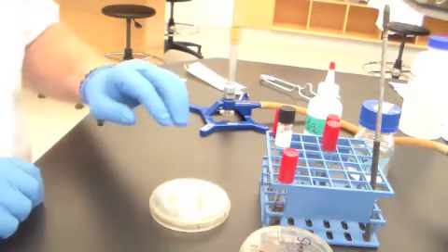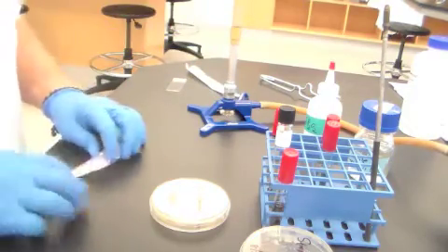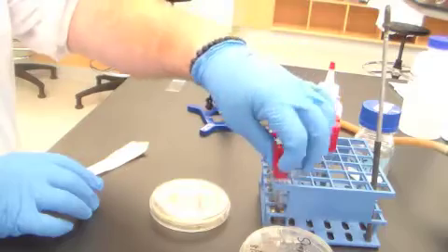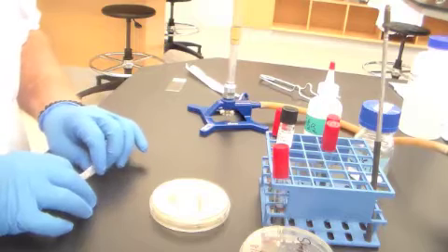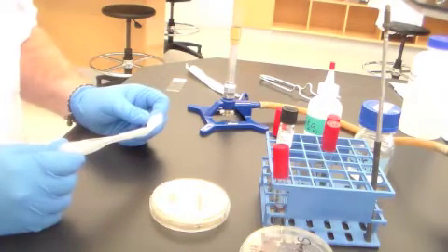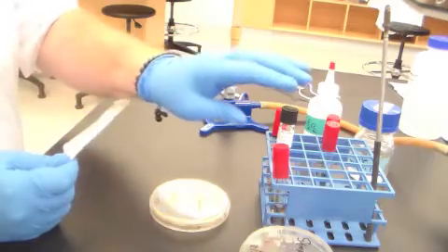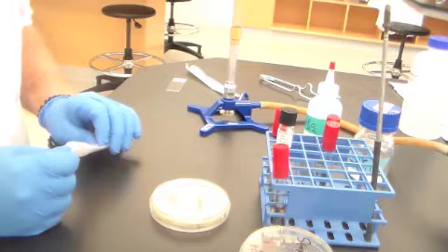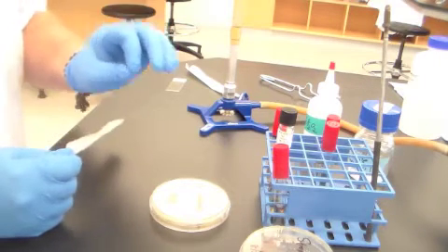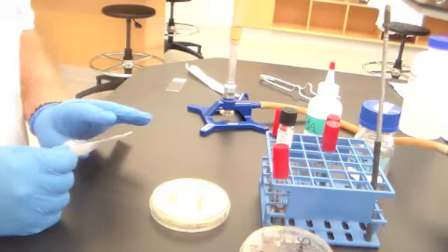Now, the other thing that's really important, in fact is critical to the decarboxylase reactions, is they need to occur under anaerobic conditions. One of the components in that medium is glucose. So in addition to having, I've mislabeled this one, this is actually ornithine. In addition to having the amino acid ornithine and the amino acid lysine, there's a small amount of glucose in here. What that does is it allows the bacterium to utilize that glucose and hopefully utilize all of the oxygen that's in there. Because bacteria that are capable of decarboxylating these amino acids can only do so under anaerobic conditions.